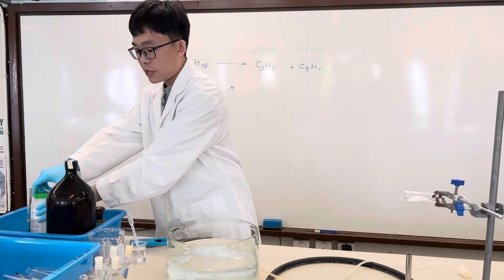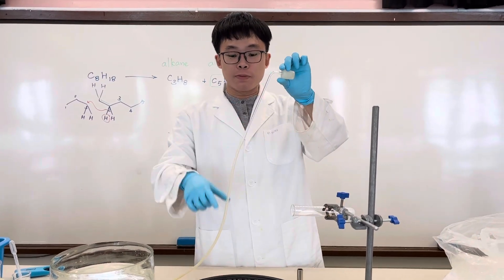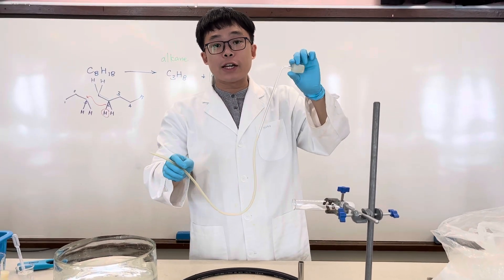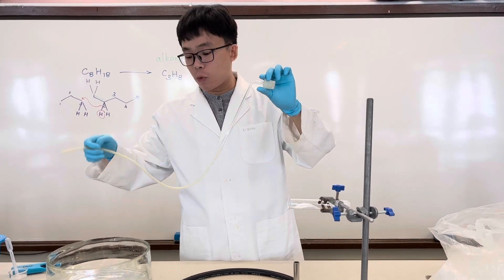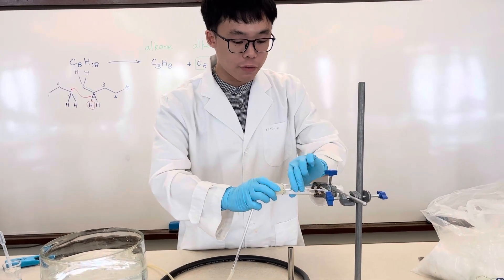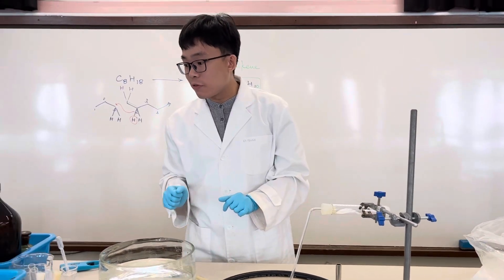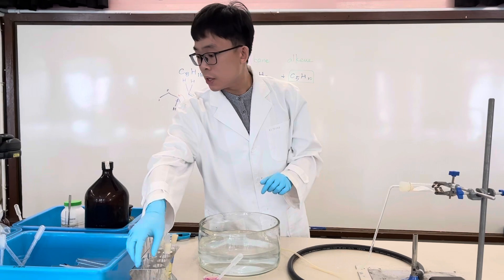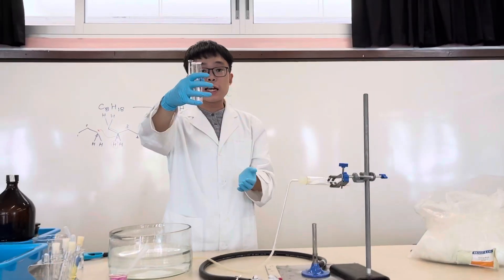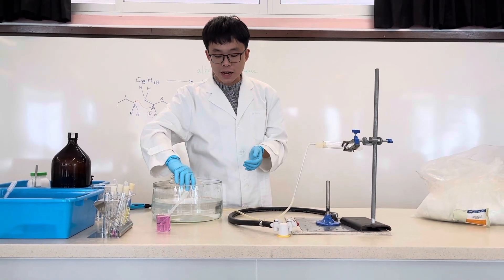I have here a one-hole stopper connected to a delivery tube as well as rubber tubing, so that later when we collect the gaseous product we can use displacement of water. We can insert the tubing and stopper it. We are going to use a test tube to collect the gaseous product.